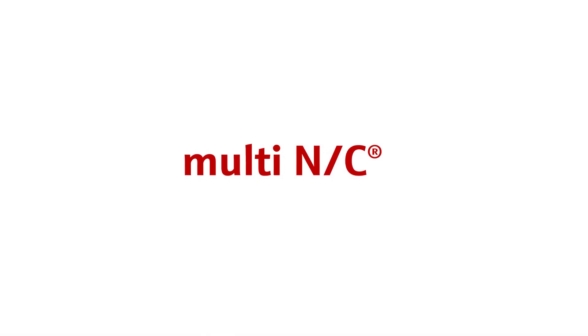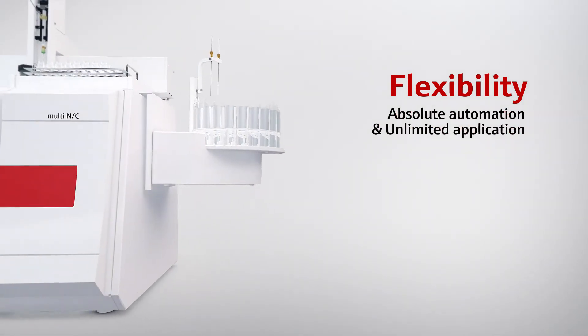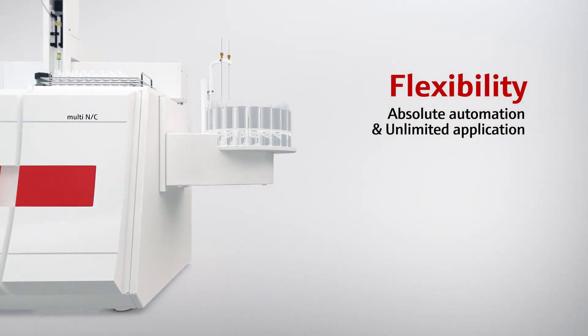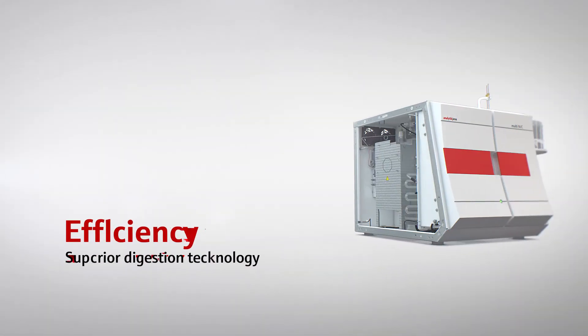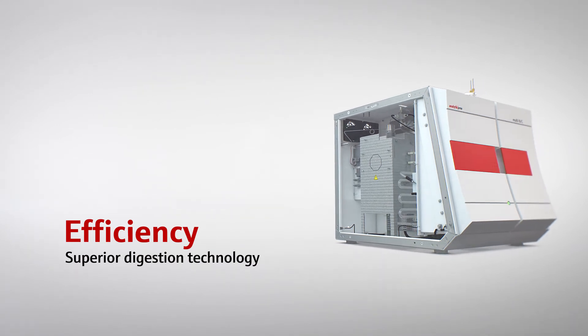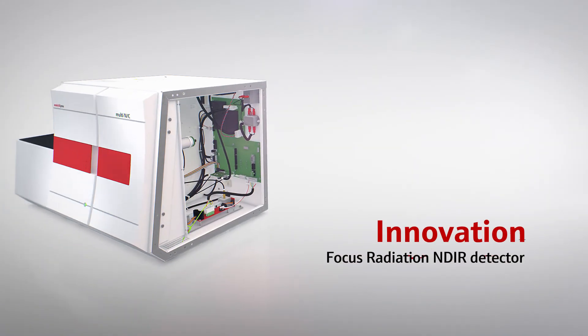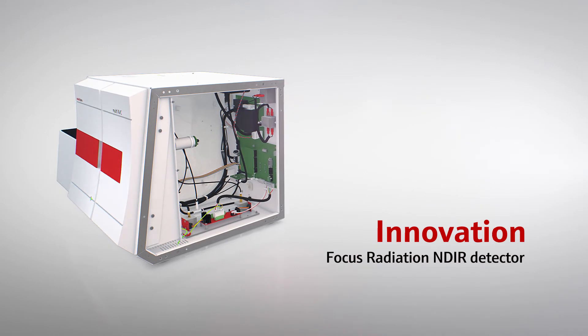The Multi-NC offers flexible configurations and the optimum solution for any TOC application. Your benefit: fast and precise results while running costs are extremely low.